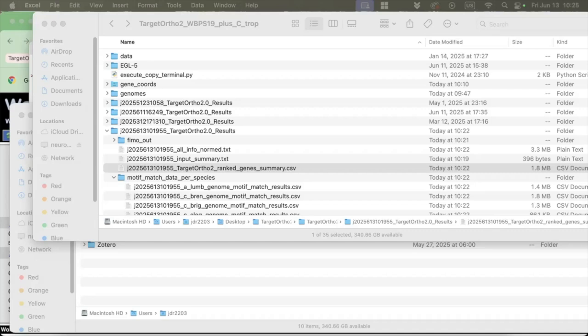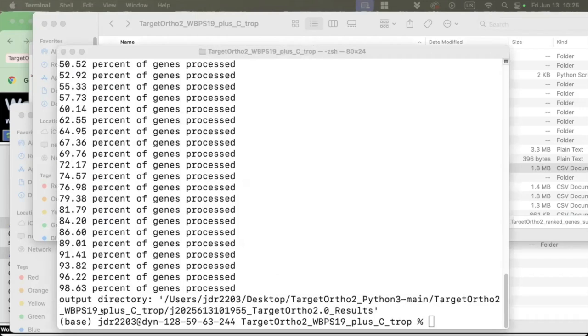So we want to update the training data file.